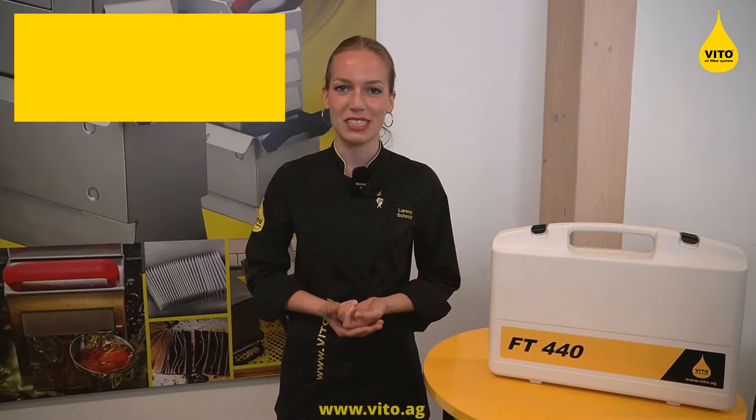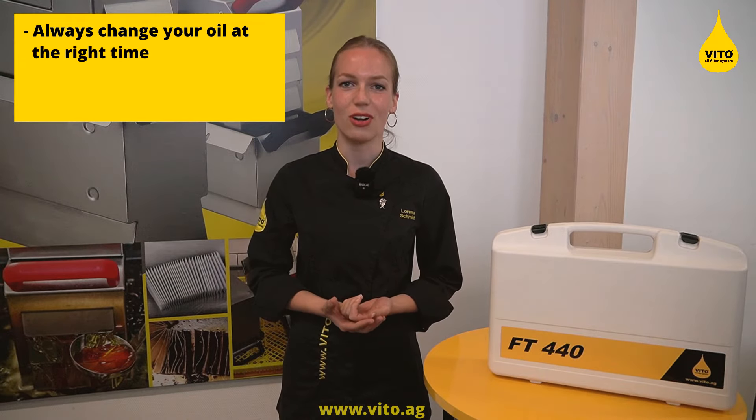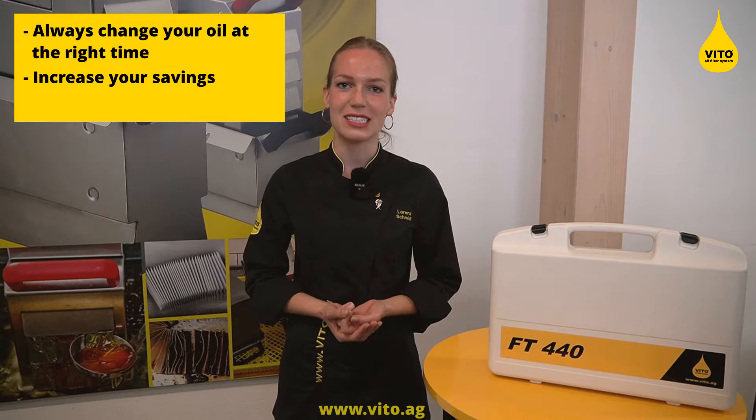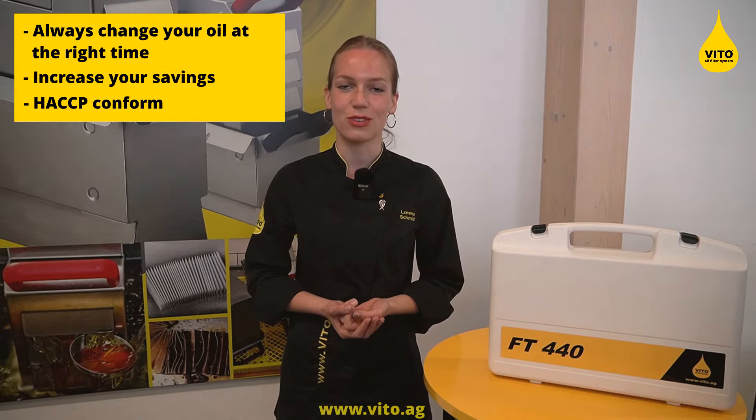Your benefits? Always change your oil at the right time, never too early, never too late. Increase your savings and it is HACCP conform.